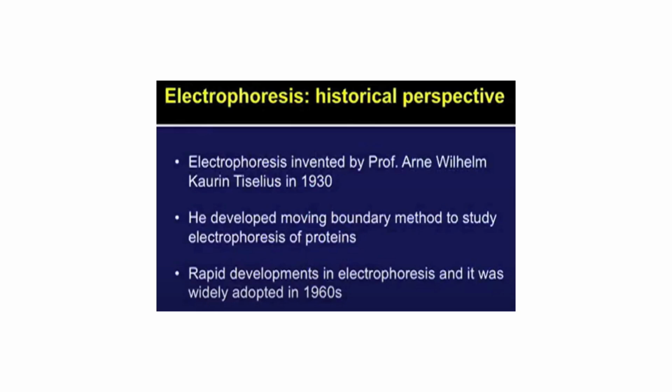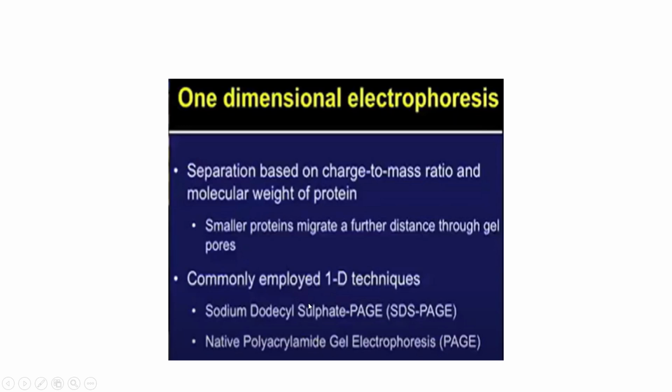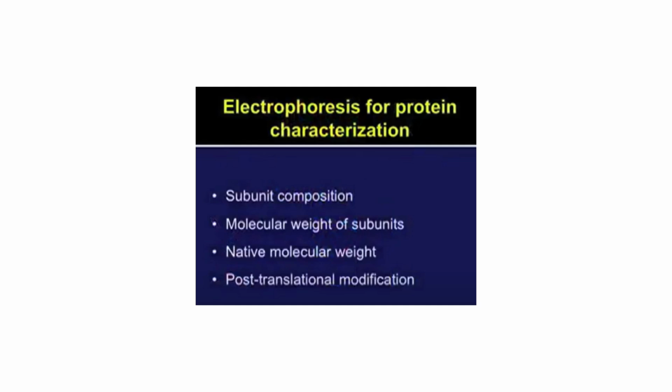Then once you have the protein, you can run the gel using electrophoresis. Who was the one who discovered that? All those were discussed. A general introduction of one-dimensional electrophoresis was given, and how SDS-PAGE is performed. SDS-PAGE depends upon the molecular weight of the protein. SDS gives the same charge to the protein. All proteins become negatively charged because of the SDS, and they get linearized as well.